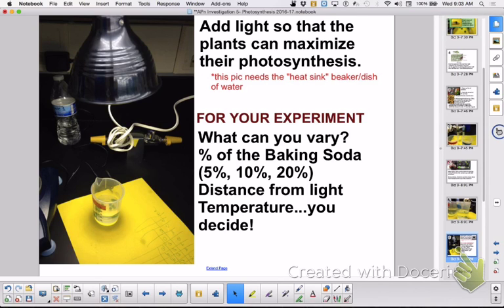So this would be part of your safety you want to be careful of. These lamps are in between, and they're labeled 1, 2, 3, whatever lab station. This is lab station 1, that's lab station 2. So get them out from underneath. And in your box of fun right now, I have a better bulb that I think works better for this lab. Try not to put your hands on this.